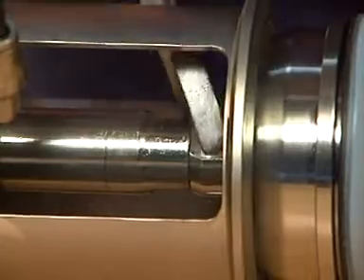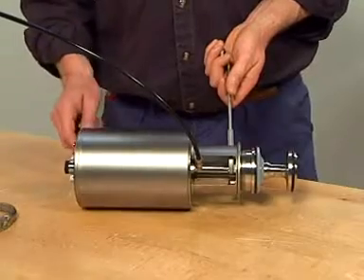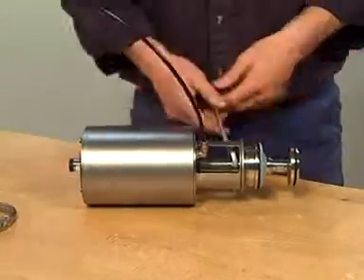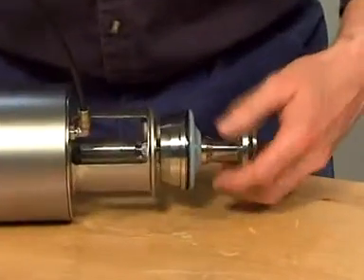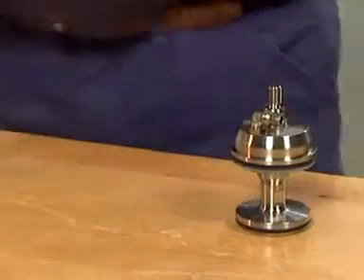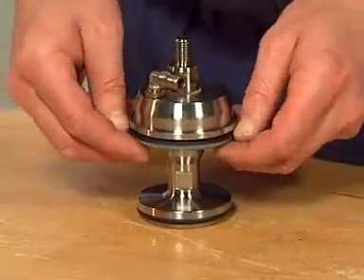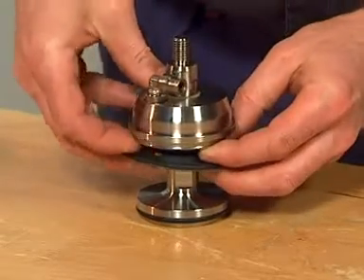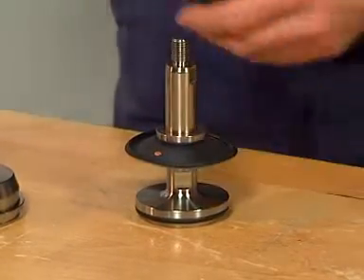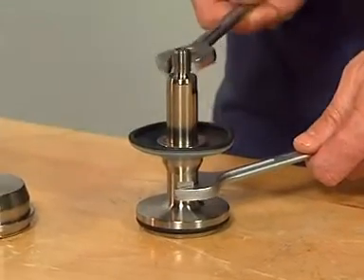Dismantle the valve plug by counter holding with two size 17 spanners. Unscrew and remove the valve plug. Release the bonnet from the valve plug. Disassemble the aseptic valve plug by counter holding with two spanners and remove the upper part of the valve stem.